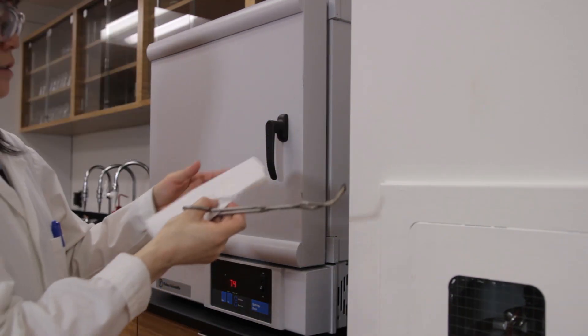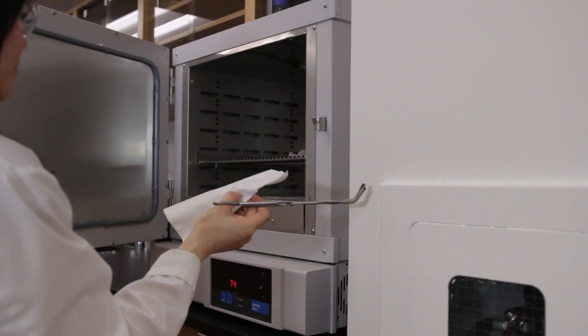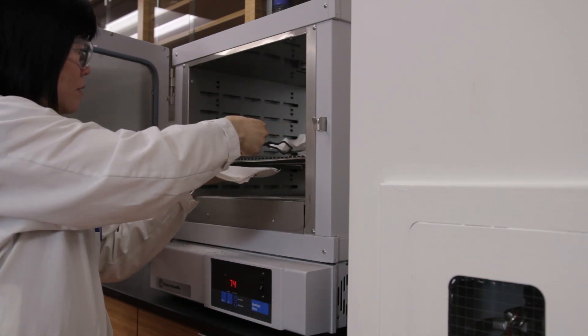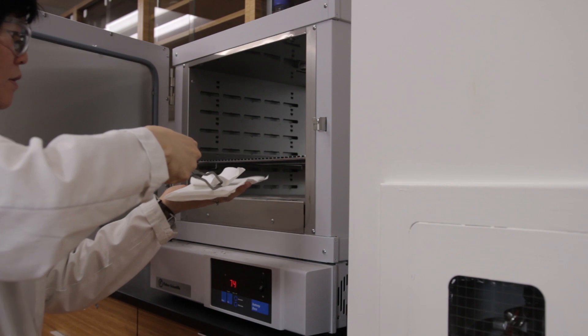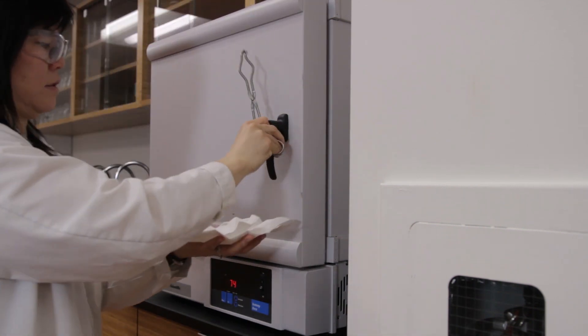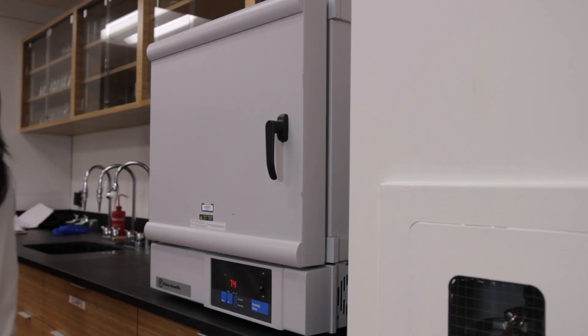Remove the filter paper and watch glass from the oven using crucible tongs. Put some paper towel on your hand and place your hand just underneath the watch glass in case it slips from the tongs. Carefully place the watch glass on the bench top and allow them to cool to room temperature.